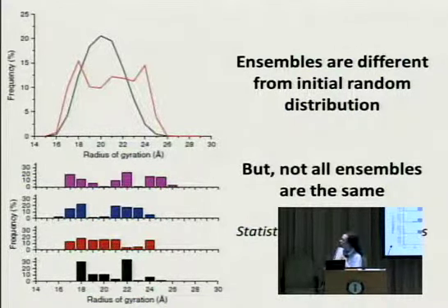And you see that you actually get this selection toward either, let's say, an equilibrium between compact structures or elongated structures. So we are discriminating against structures which have an intermediate radius of gyration, which is actually in line with what you would expect. Calmodulin can either have a closed structure or tends to be in the extended configuration, and so we can pick that from the data.